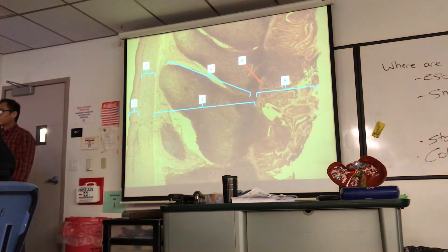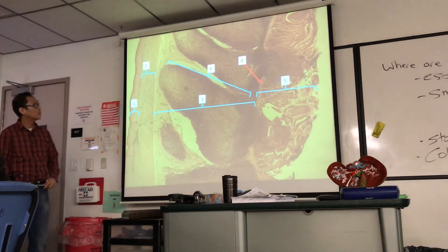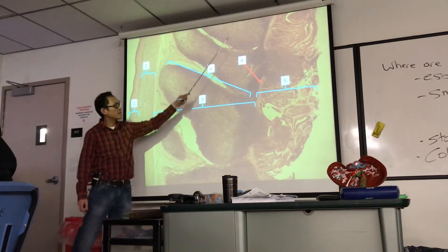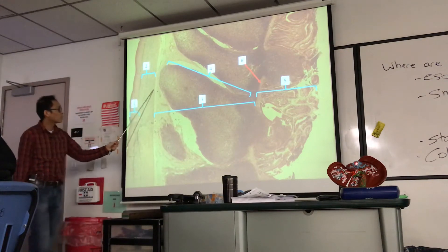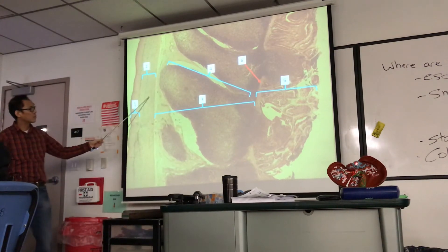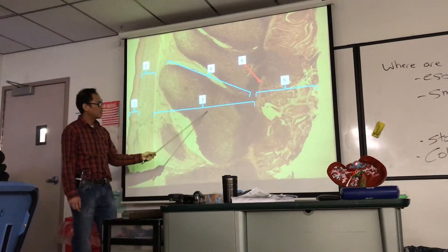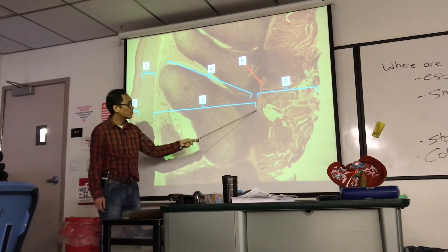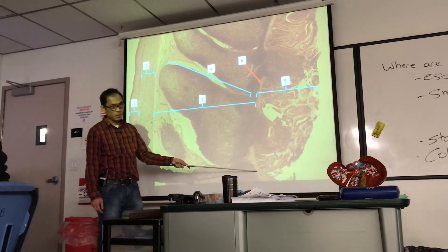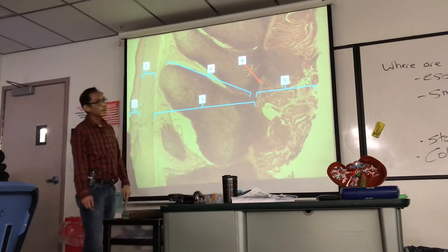Ileum — look for the MALT. Do you see it? The big purple splotch, number four, is MALT. It's huge — it's all MALT. Out here are the two layers of muscularis externa: longitudinal and circular. This is all submucosa. This is mucosa-associated lymphoid tissue — MALT. This little strip of smooth muscle here, number six is pointing to, is muscularis mucosa. So number five is mucosa. This is ileum.